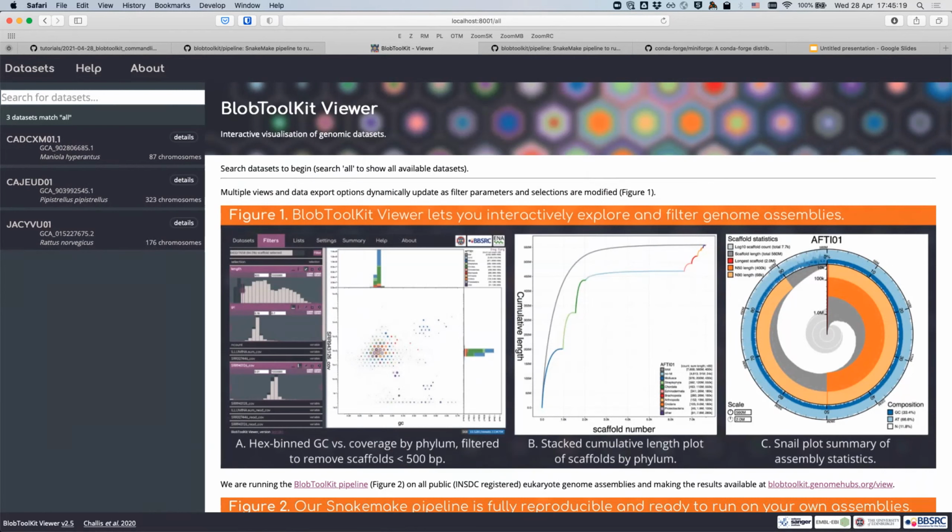The connector requires you to break it up into 10 different pieces and run the GC coverage statistics separately. So for a while, it will be on the public website, but only for the new assemblies, not for the old assemblies. Eventually we will run it across everything again, and then you will see it for everything. But initially, it'll only be for the new public assemblies, not for the old ones. Okay, so this is all great.